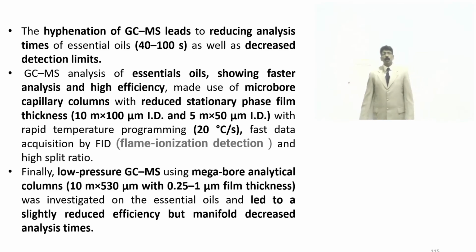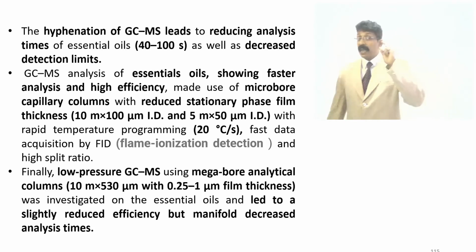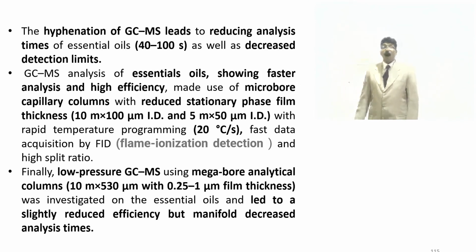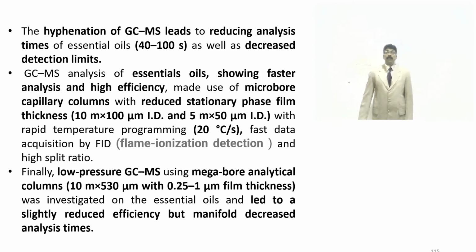Finally, low pressure GCMS: gas chromatography connected with mass spectroscopy by means of hyphenation, our online detection technique using two instruments, with a megabore analytical column of 10 meter length and 530 micrometer diameter, with 0.25 to 1 micrometer film thickness.